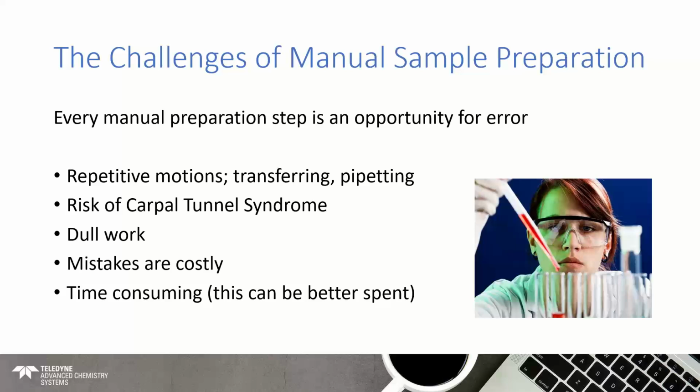If you have a large project you're working on, I give the example of a couple of hundred samples. If you're preparing several sample racks of samples for an analysis, it really is dull work, and there really is the opportunity there for errors and the need to do reanalysis if you're focused for several hours on preparing samples in that way. So mistakes can be costly because you want to avoid reanalysis.